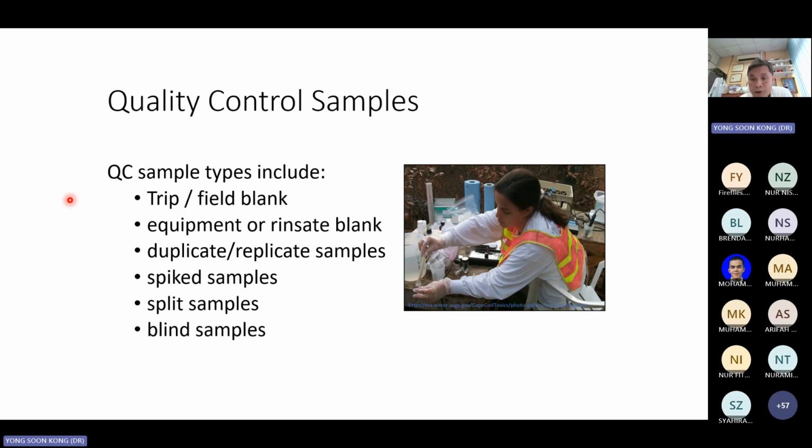So before I continue, this image kan, have a look. Once again, the sampler tak pakai mask, dipakai luminous. Do you have to wear luminous during that field trip day? Or is there other PPE that you should wear? So water group, PK kan, yeah. But of course lah, they will always wear glove, yeah. So nanti tak perlu pakai mask lah, since these many pictures already shown, you don't need to.